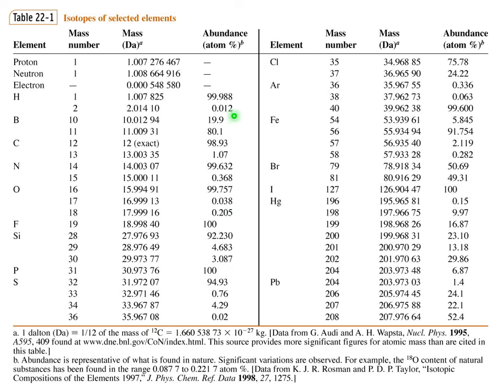Now, abundances of each isotope sometimes are known exactly. Very important are monoisotopic elements: fluorine, phosphorus, iodine. Almost monoisotopic is argon. Very close to monoisotopic is hydrogen, but it is not exactly.